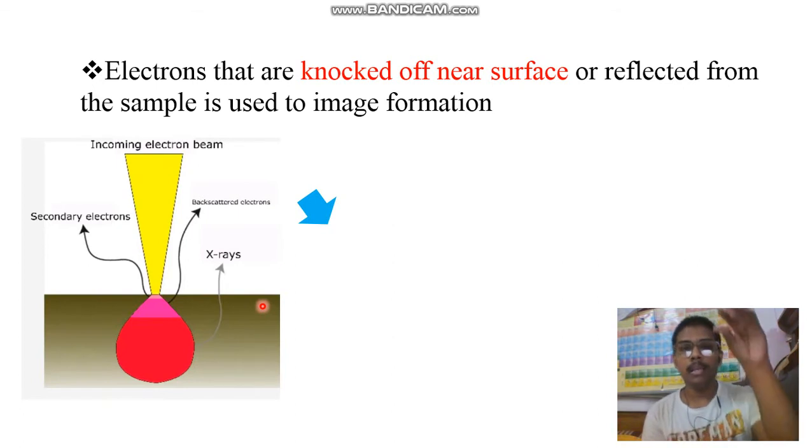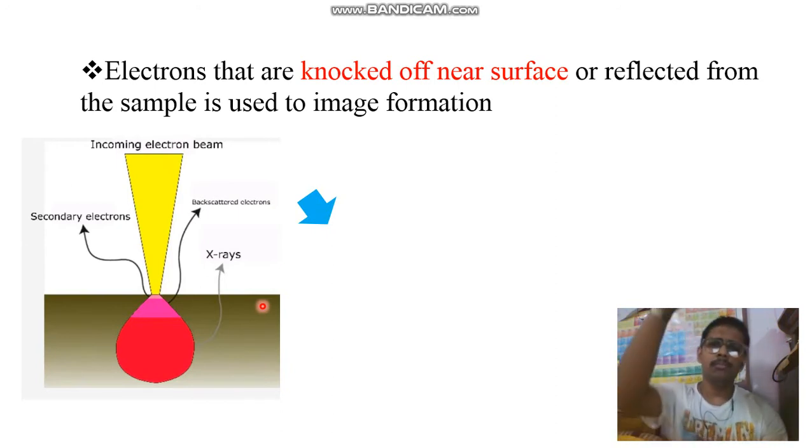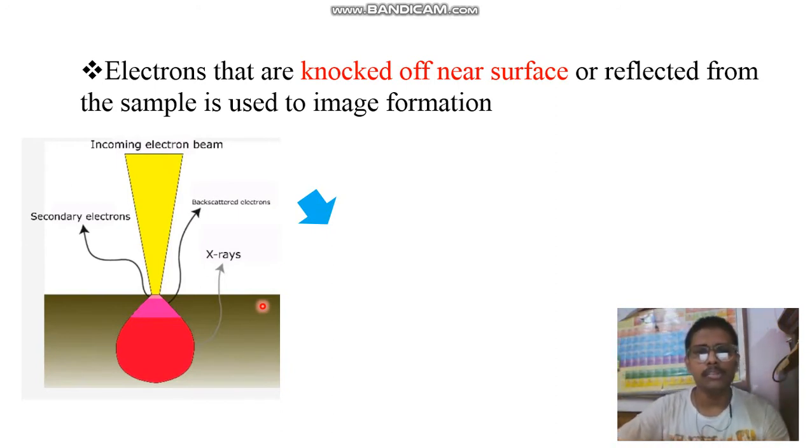Now whenever an electron beam comes and makes interactions with the material, 3 types of interactions can happen, taking reference from my other video on transmission electron microscopy. One is with no disturbance, where the electron beam will just pass through the sample, and that will not happen in the case of scanning electron microscopy. The other 2 types of collisions, inelastic collision and elastic collision, will happen here.